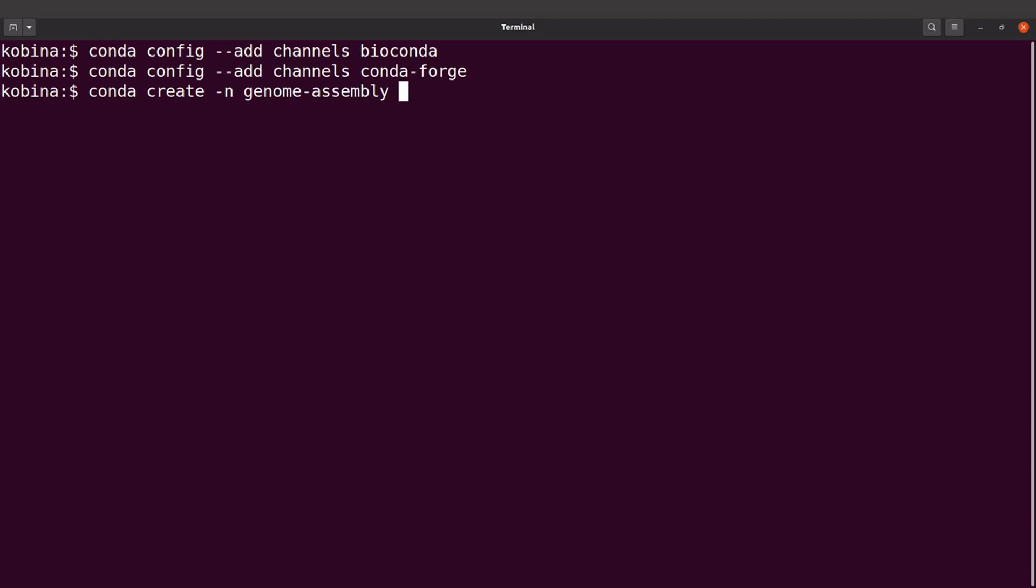Let's run this command. Let's type Y to confirm and then conda will start its work downloading the packages.